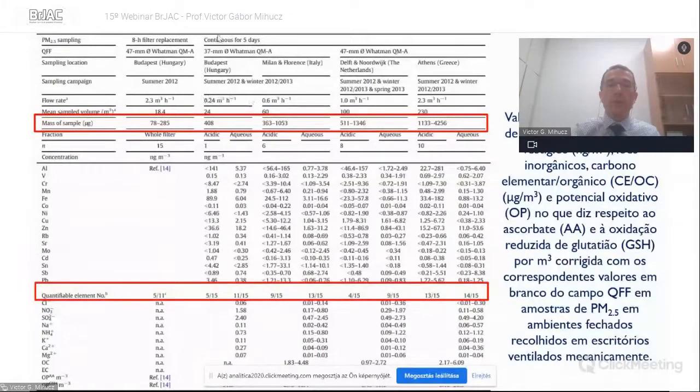And what we observed is that it depends on the flow rate of the pump. If the flow rate was higher, so you see tolerant people in Southern Europe, because they could support the noise of the equipment for 5 days, in that case a sufficient amount of PM was collected, and many of the 13, 14 elements out of the 15 that we could monitor by the high resolution ICP equipment that we had at that time.